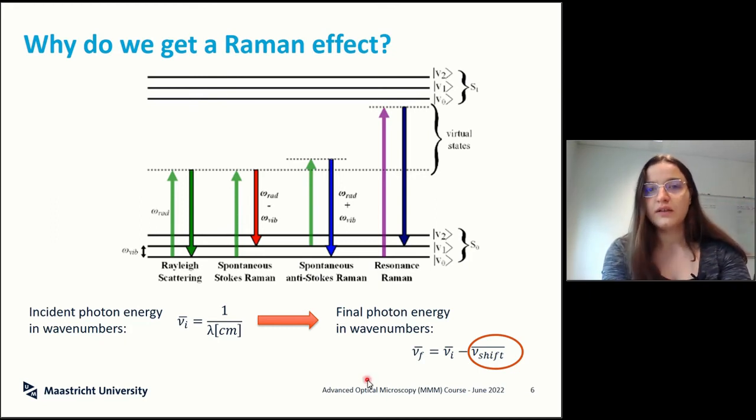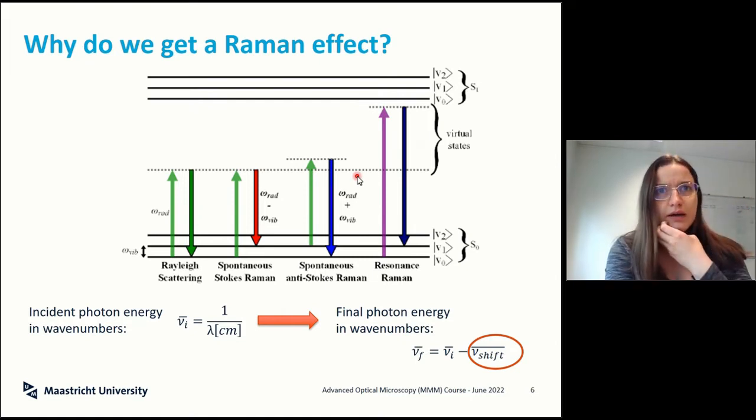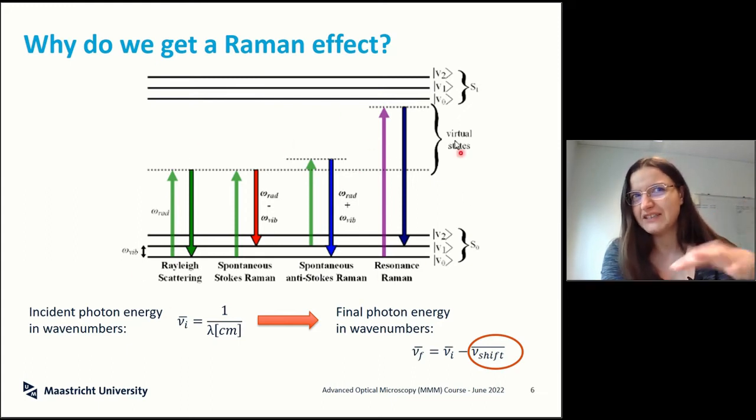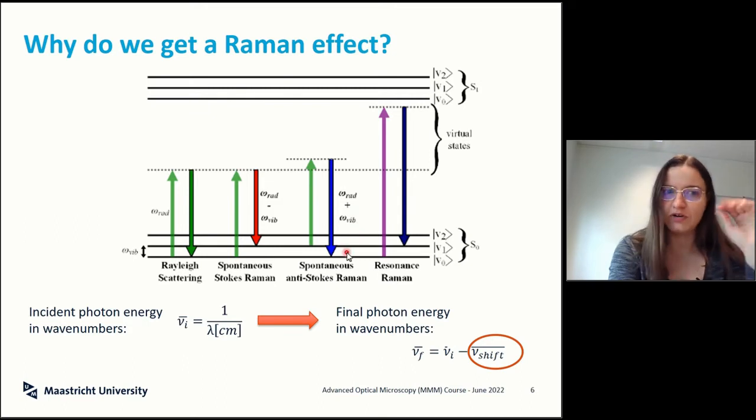There is also this possibility, which is a bit more complicated, in which you apply the same concept, but you bring a radiation into the sample that can carry up almost to the excited level. So that brings the states into a sort of resonance state, so this effect will be much stronger, much more interesting, and it could highlight stuff that you wouldn't be able to see with these two methods, but this really requires some tricks, and we're not going to go into that.